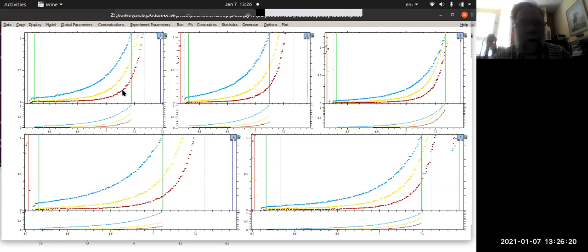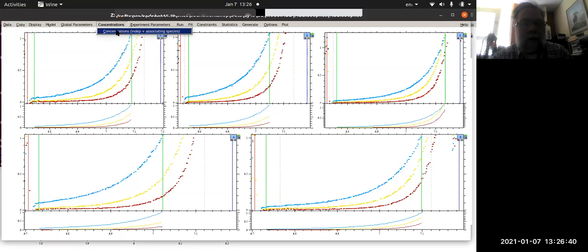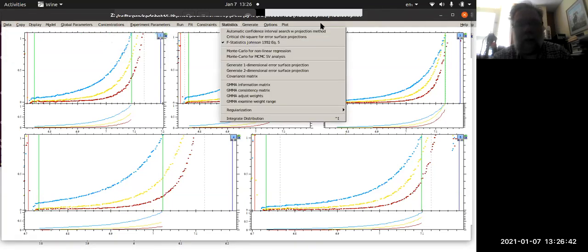One is for each different speed. Blue looks like it's the slowest speed, yellow looks faster, and red looks faster still. But the experiment was set up with 3 different ratios of A and B and 3 different total concentrations of A and B. Those things would need to be entered in parameters, and in the concentrations for all of those different independent species.